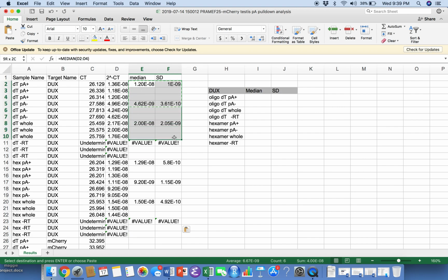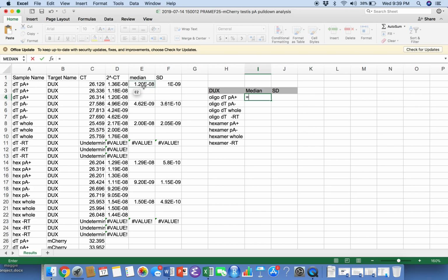Unfortunately, this format isn't really conducive to making graphs in Excel. So this other box over here, I typed this before, and you can retype it or you can just copy the one that I made. But I'm just going to reorder these numbers in this box. And I'm going to do that by clicking equals again, but instead of typing an equation, I'm just going to say I want you to equal this value in this box. And you have to go down the row and tell it where all of your medians are.